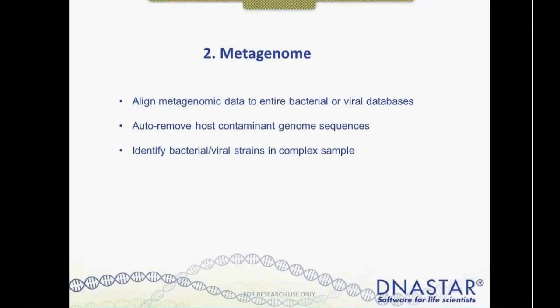So, metagenomic workflow. If you have projects where you have 16S RNA, or viral sequences or bacterial sequences, just a complex mix, oftentimes a goal is to identify what's in that mixture. And there are different challenges to aligning metagenomic data.